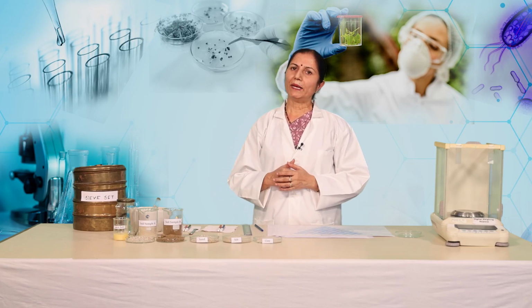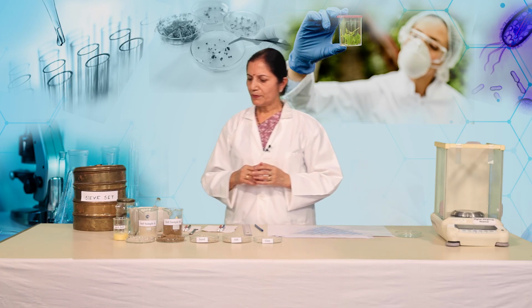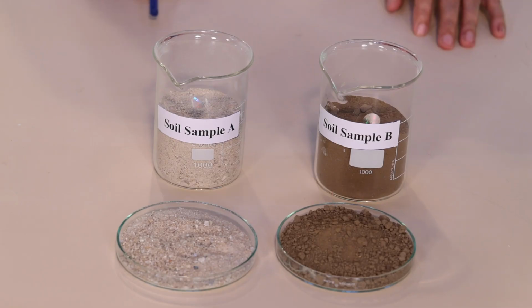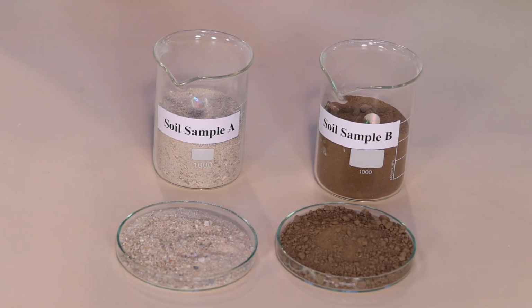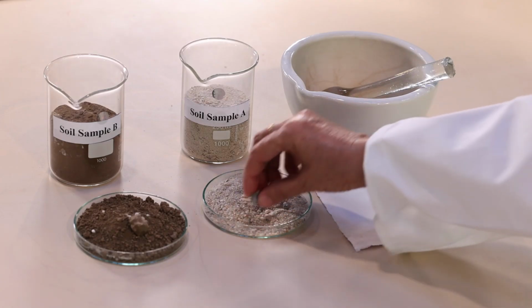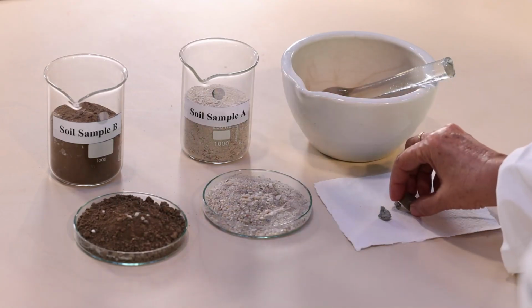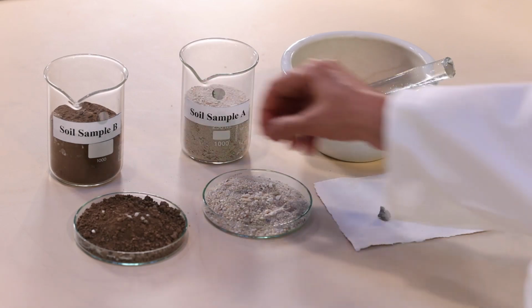Let's study method 1. In this method, we have to collect 200 grams of soil sample from different locations. Label them as sample A and sample B. Remove the stones, or any roots if present.